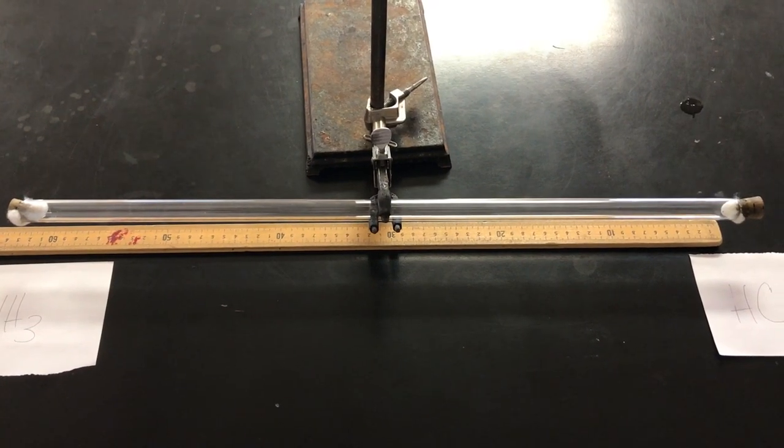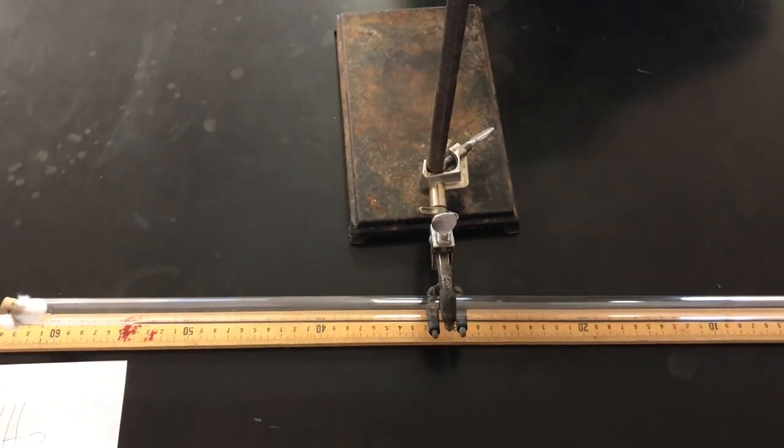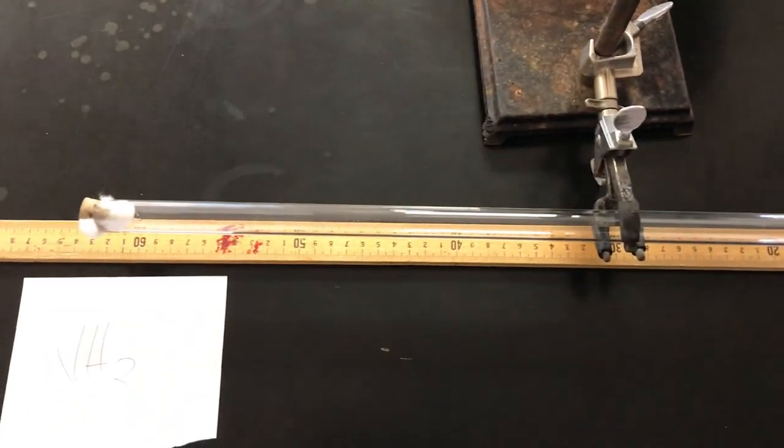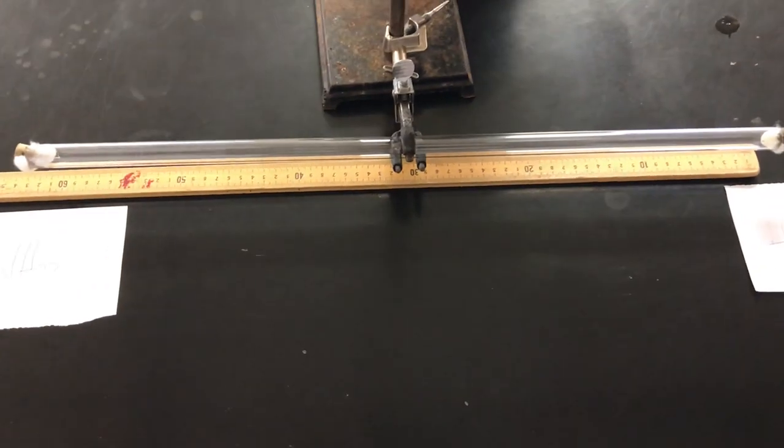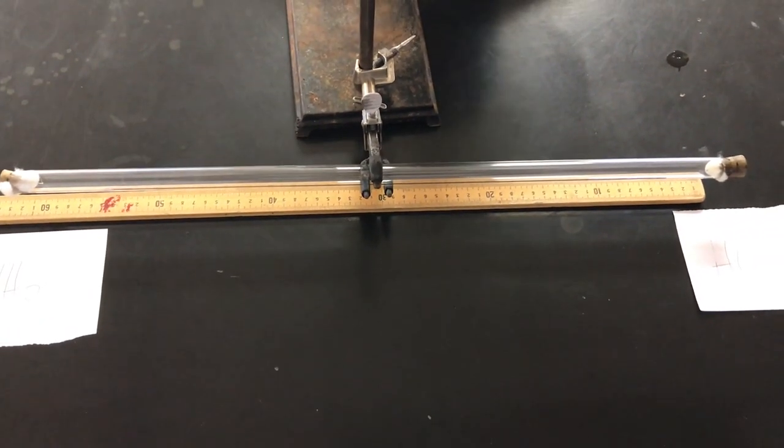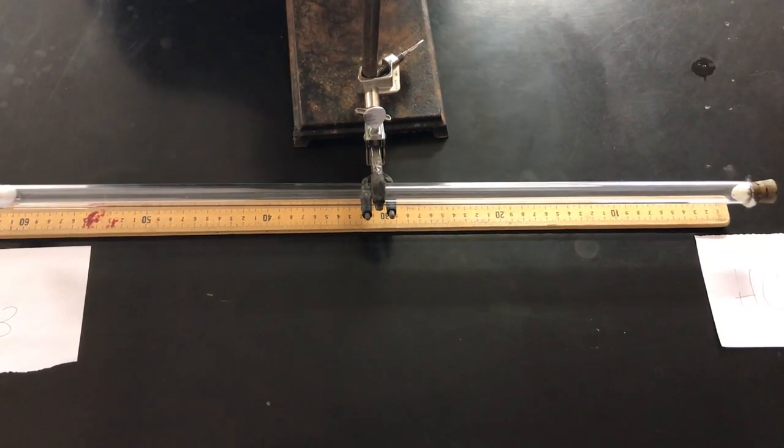Will these two gases meet in the middle? Will they meet right here where the clamp is? Are they going to meet over closer to the ammonia? Or the HCl? What does that depend on? Depends on how heavy the two gases are. The particles of the gases.